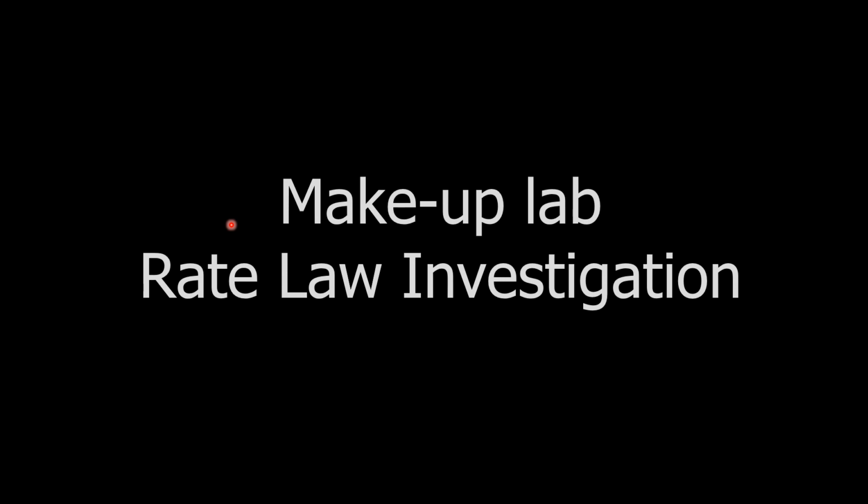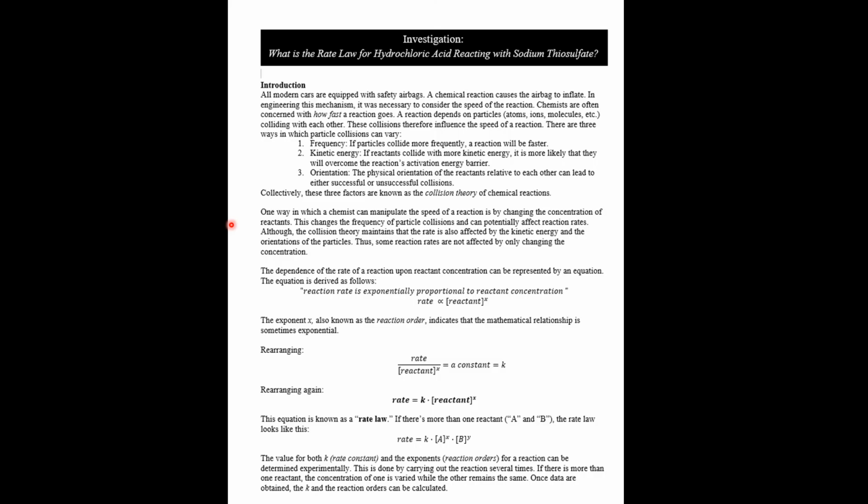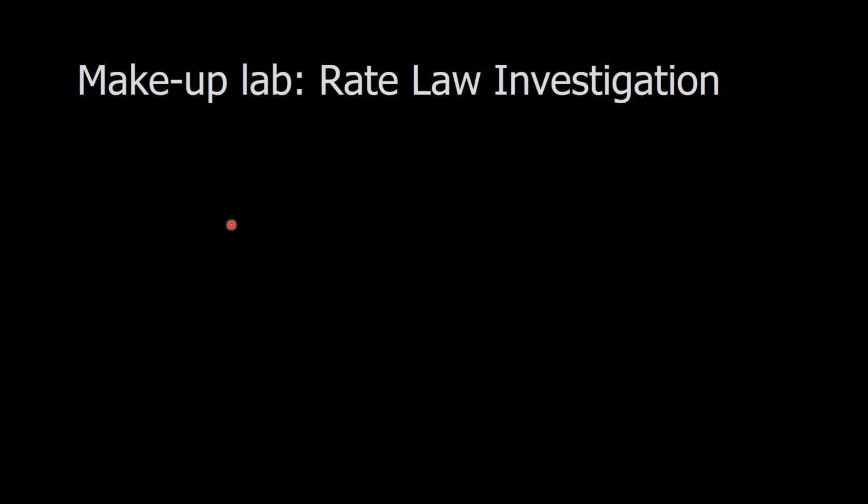Welcome to the Makeup Lab for the rate law investigation. The corresponding page in the lab manual is going to look like this. There will be a question up at the top that says, what is the rate law for hydrochloric acid reacting with sodium thiosulfate?